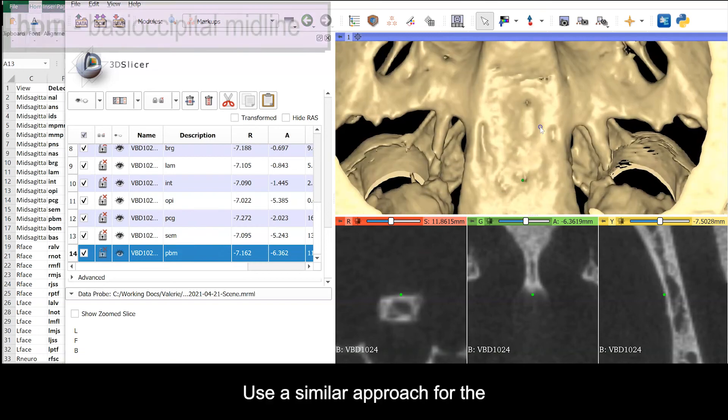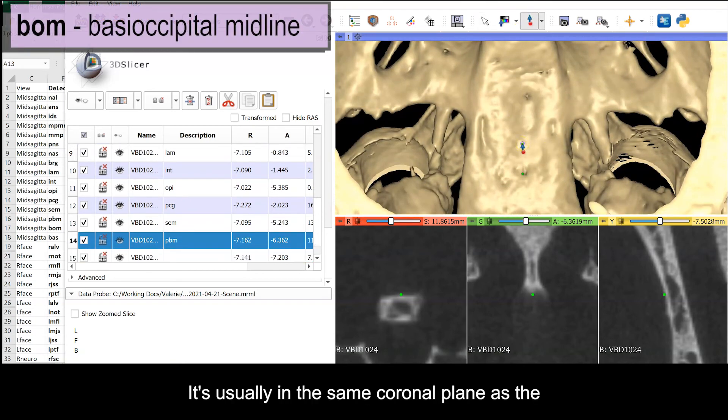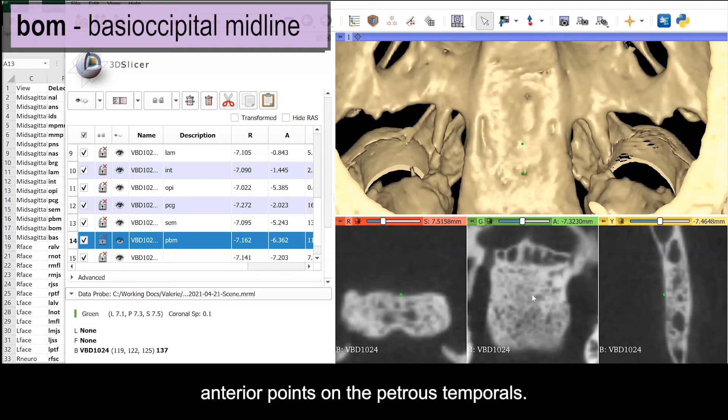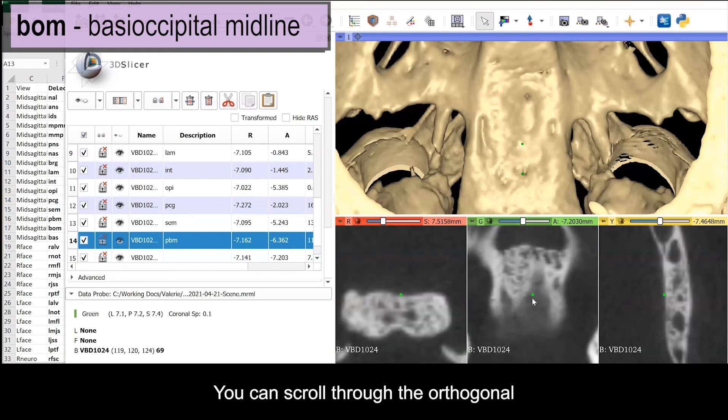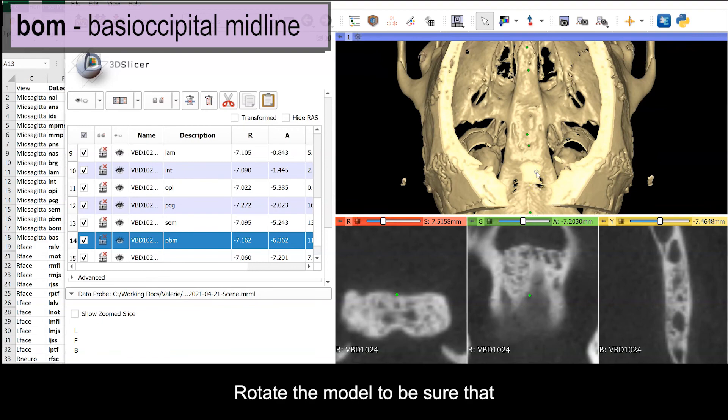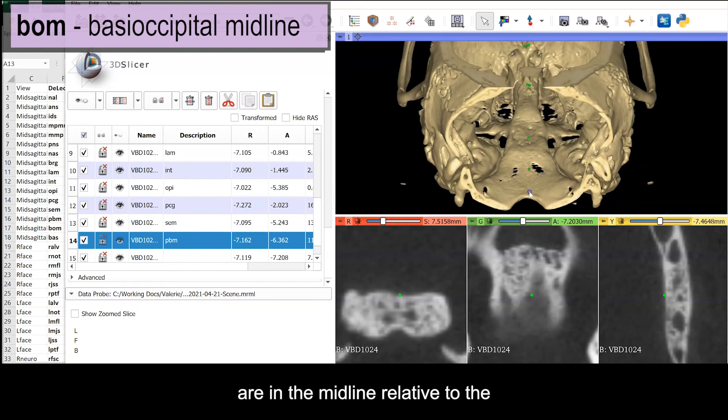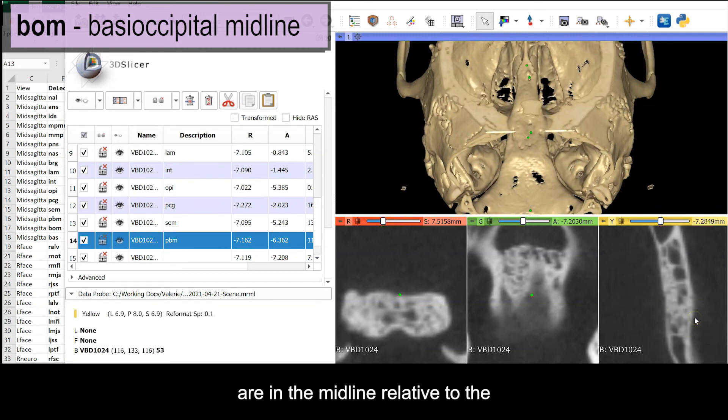Use a similar approach for the basy occipital synchondrosis. It's usually in the same plane as the anterior points on the petrous temporals. You can scroll through the orthogonal views to find and confirm the position. Rotate the model to be sure that both the intrasphenoidal and the basy occipital synchondrosis are in the midline relative to the overall structure of the cranial base.